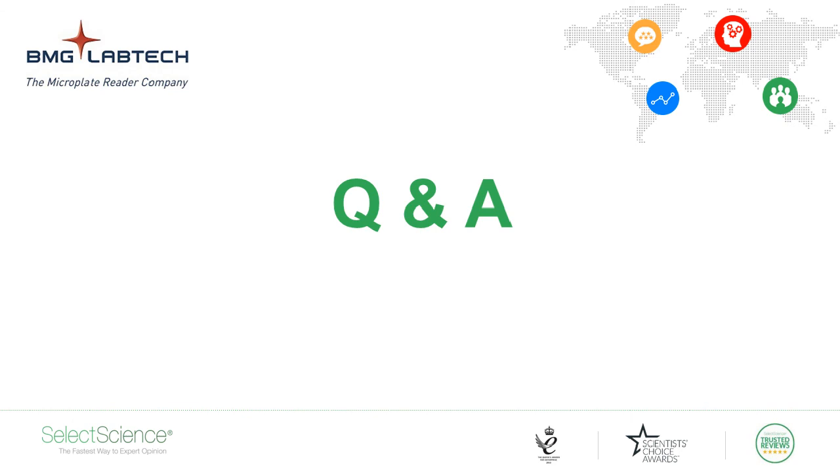So, the first question I have here is, do you remove redox cycling compounds from the HTS screening library? We typically don't remove compounds once we've identified them as redox cycling, because we found it's more work to cherry pick compounds out of the library than it is to flag them. So we flag them in our database, and then if they appear again for a different screening campaign, we can remove them immediately without wasting any time on them.